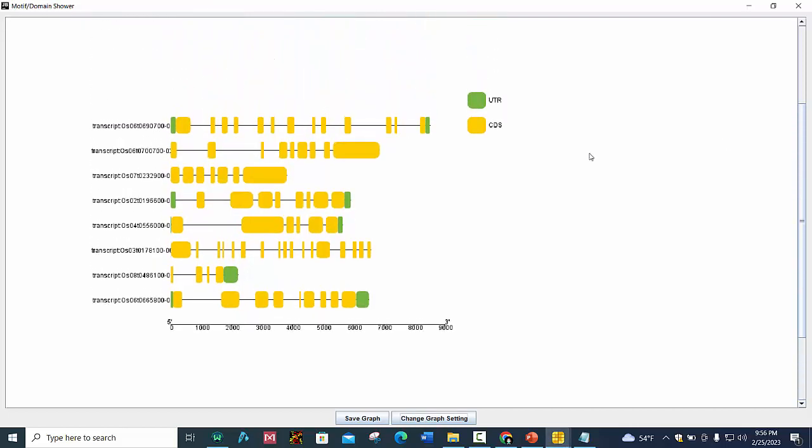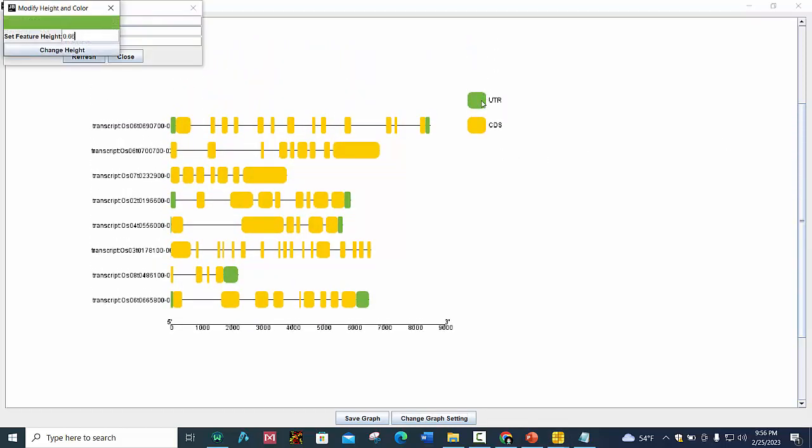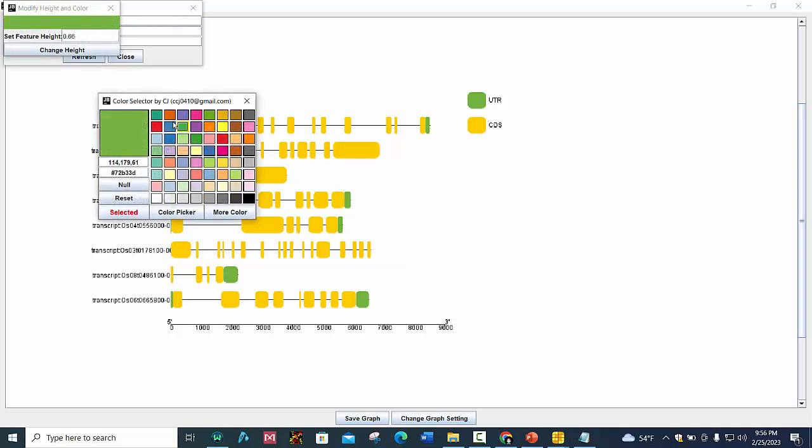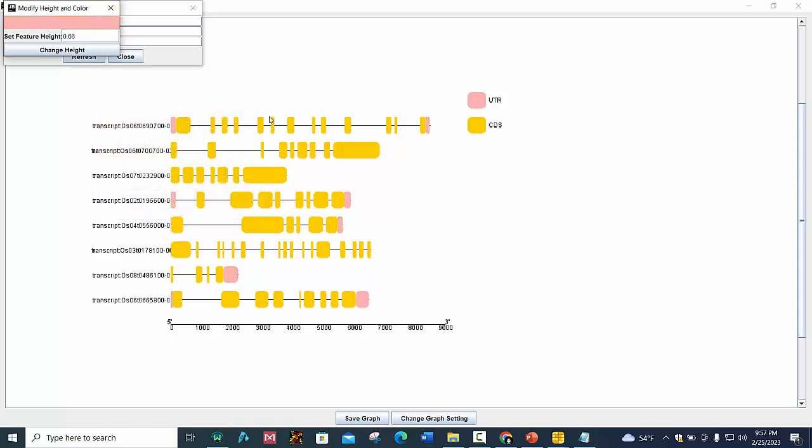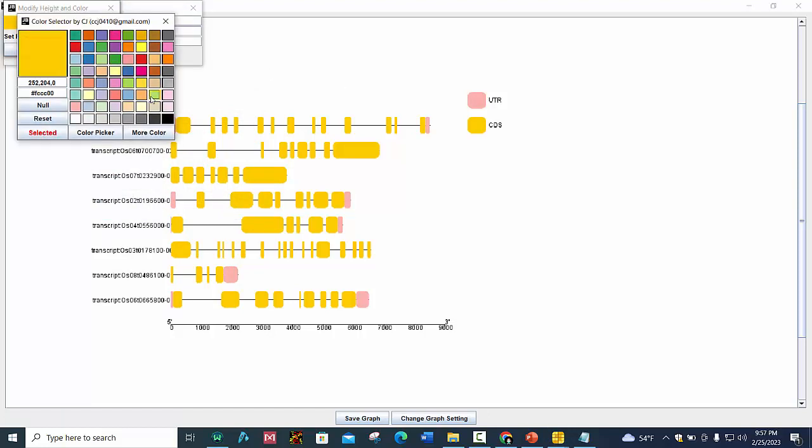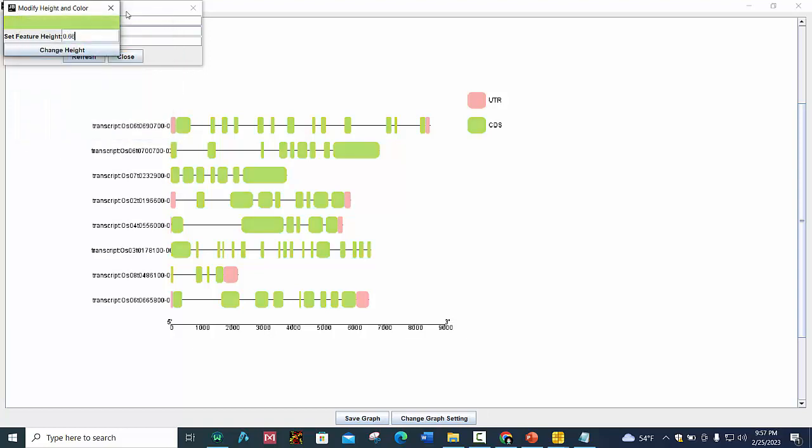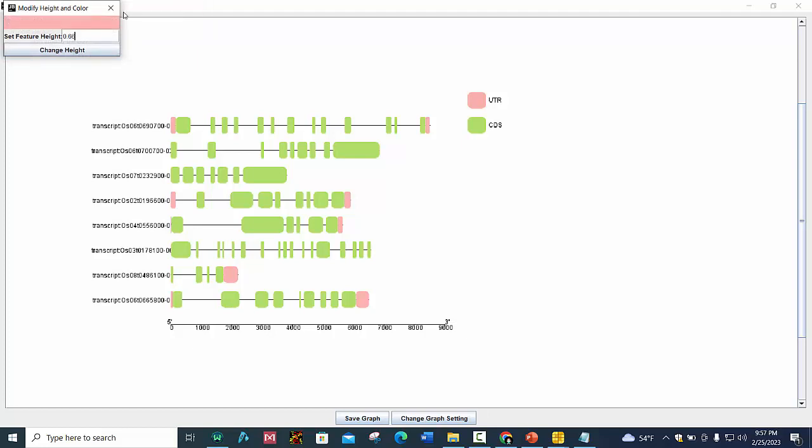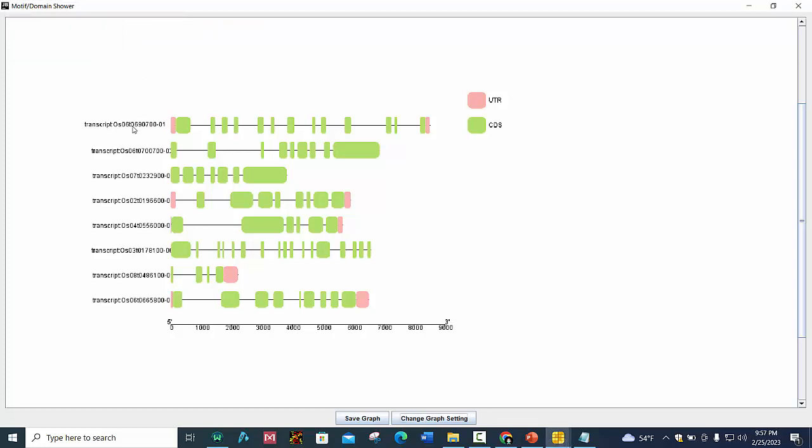You can also change the color by pressing this and choose whatever color you want to set and press Select. This CDS can also be changed to whatever color you want. You can make your changes accordingly.